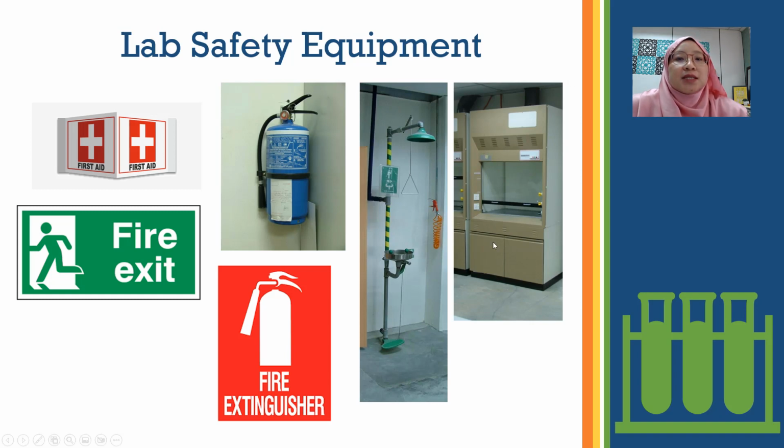So this is the chamber. Make sure that you do all the experiments that use chemicals inside this.